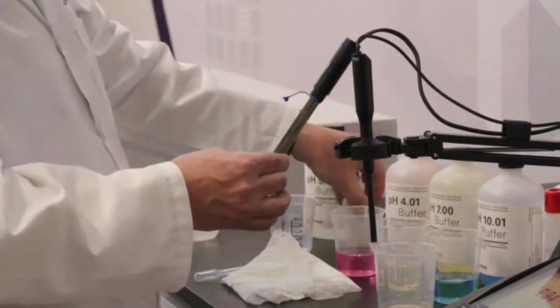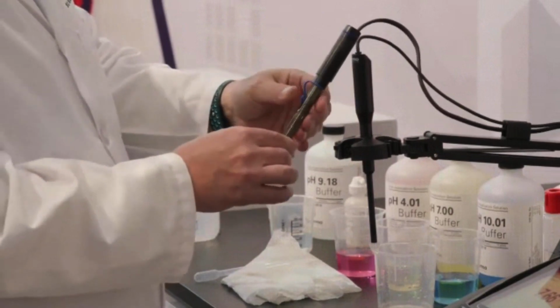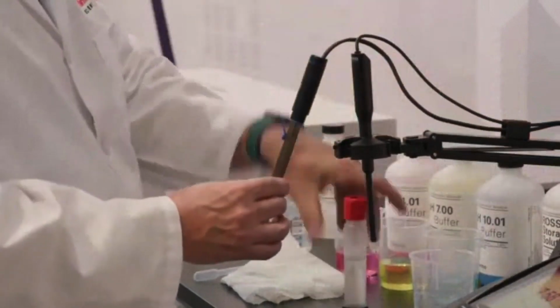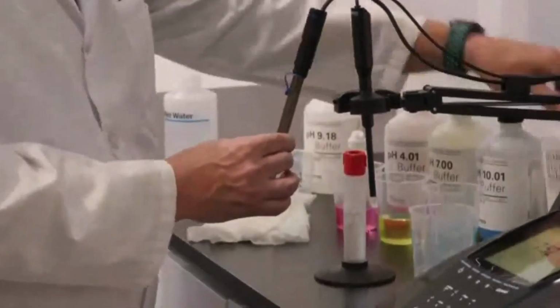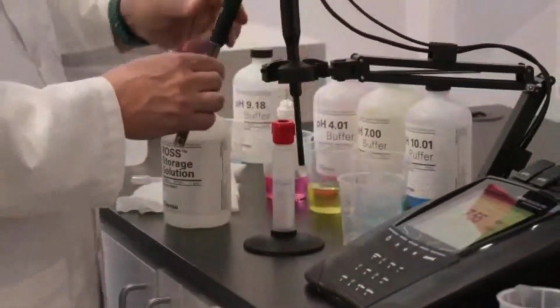That helps prevent any contamination that might have been caused from samples, prevent evaporation and formation of crystals in the electrode, prevent growth of mold, and generally just keep your electrode performing well.